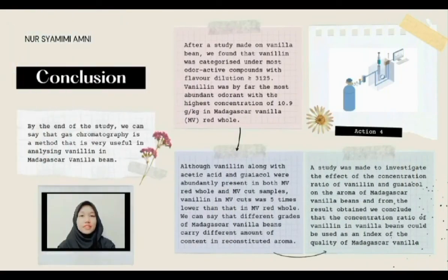By the end of this study, we can say that gas chromatography is a method that is very useful in analyzing vanillin in Madagascar vanilla bean. After a study made on vanilla bean, we found that vanillin was categorized as the most odor-active compound with flavor dilution equal to or more than 3,125.